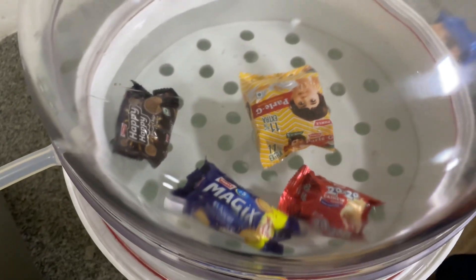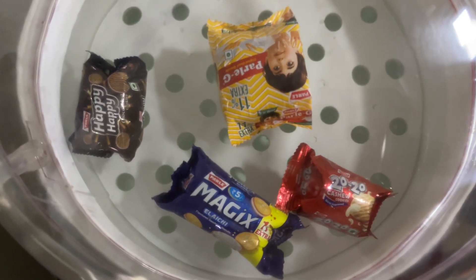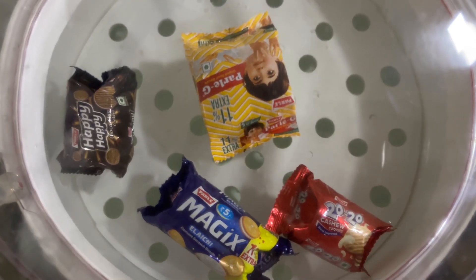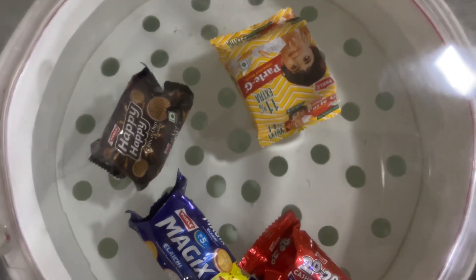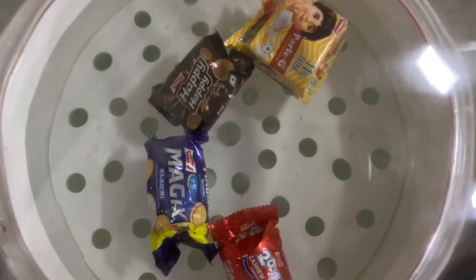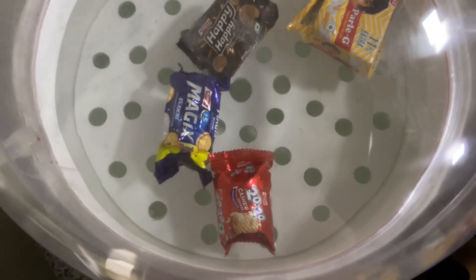The vacuum is holding for 15 seconds. As you can see, there are bubbles coming out of the Parle-G packet. There are small bubbles which you can observe.